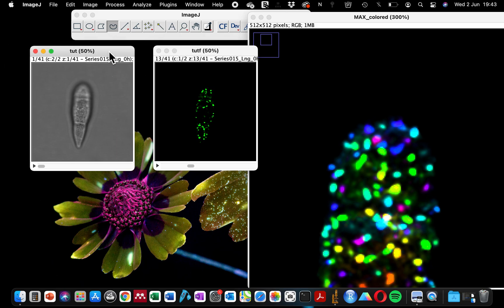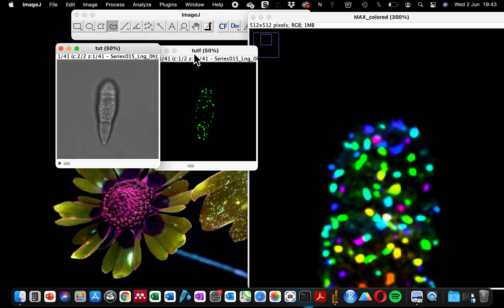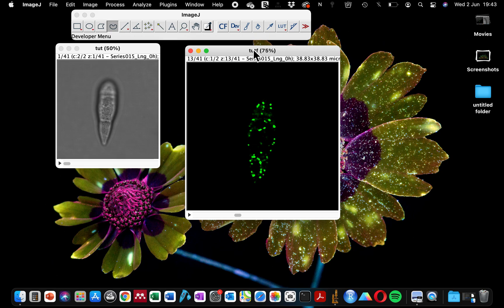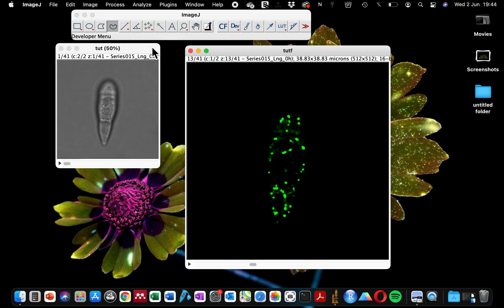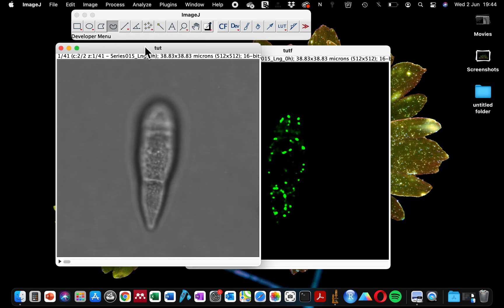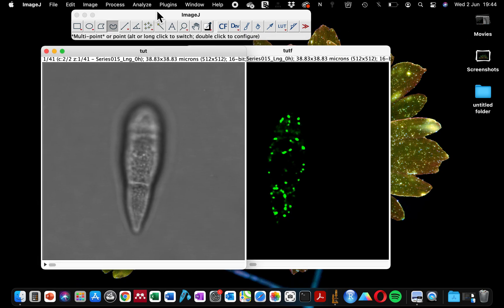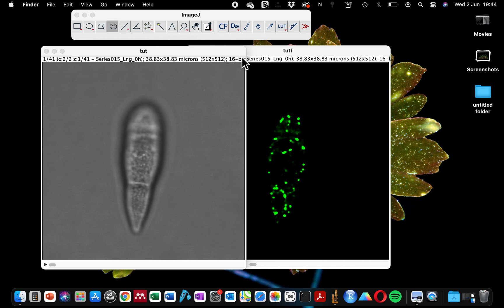This is the original image, the green and the bright field image. When you open your microscope image in ImageJ, the two channels will be together.